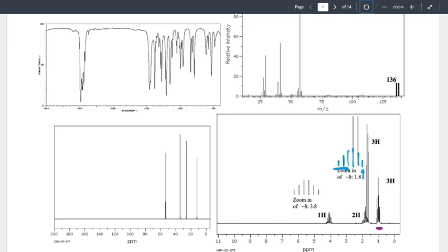Well, Jazz was like, yep, I agree, it could be the same, and then you went, what's the... the fact that the purple has more hydrogen, one more hydrogen than the orange one. This CH3 is next to a CH, this CH3 is next to a CH2, which means those two CH3s are not duplications. So what I could try and do then is say, okay, I'm going to draw that one.